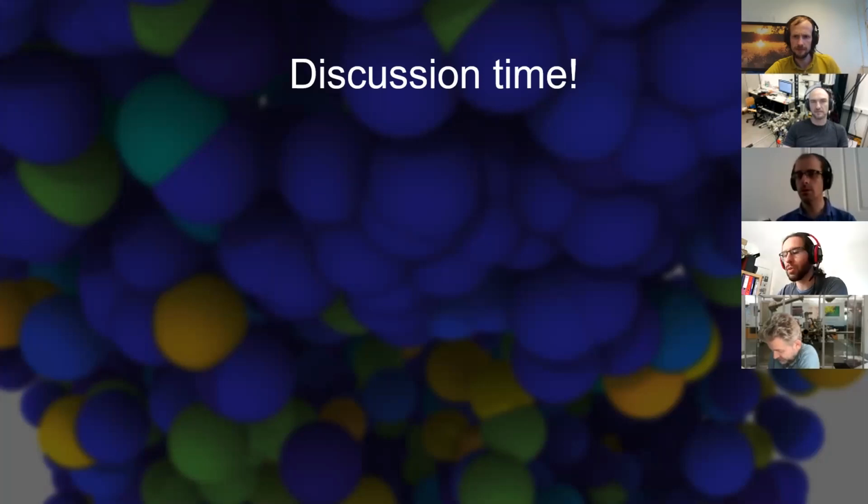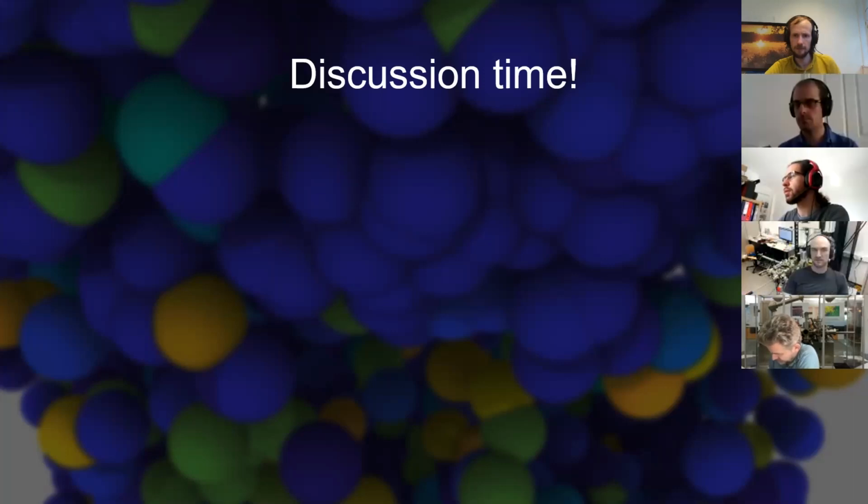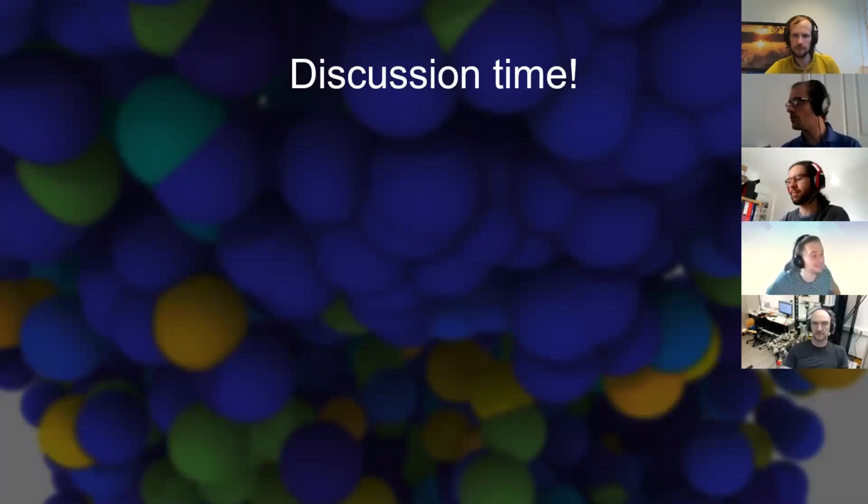Dan, were there other questions you'd been able to see? There were. I'm just having a quick chat through them here. We've had one from Martin Meyer at Oxford regarding Jens. Jens, are you still on the line? Yes, I'm still here. With your code, is there a specific need for certain MATLAB versions to be able to support that? What versions of MATLAB going forwards are you supporting? I'm not 100% sure, but it should be something like 2016 upwards, then there should be no big problem.